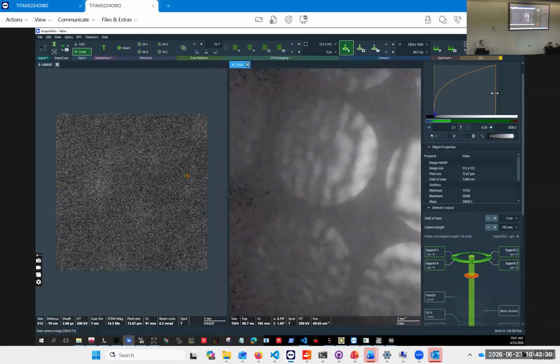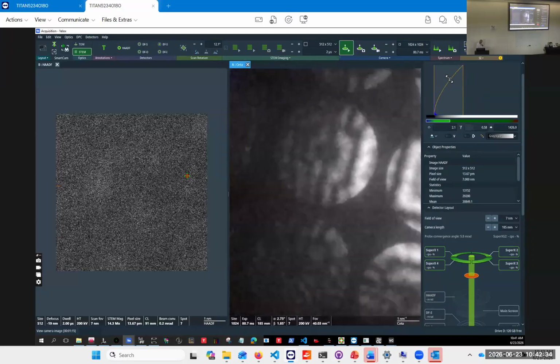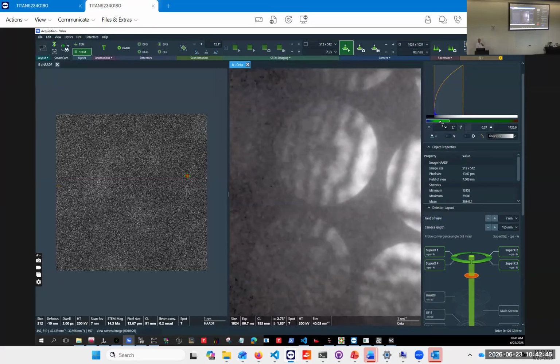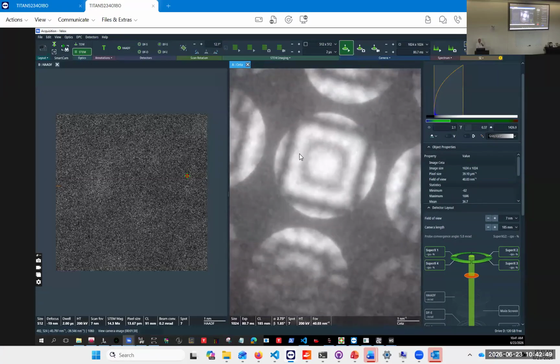is also something that we want to simulate. And so this is all due to our excitation error. So we have these two different parts here, two different stripes, and that is related to the thickness of the sample.